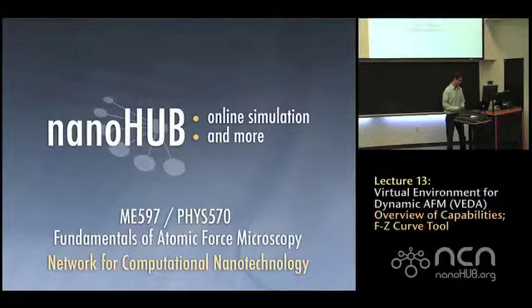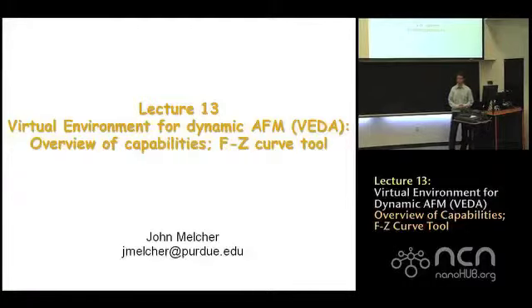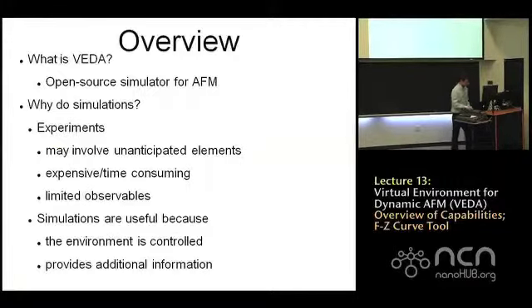nanohub.org. So I'm John Melcher, and I'm going to give you guys an introduction to VEDA, which is a virtual environment for dynamic atomic force microscopy. And I'm one of several people in Professor Rahman's group, which has been developing these simulation tools.